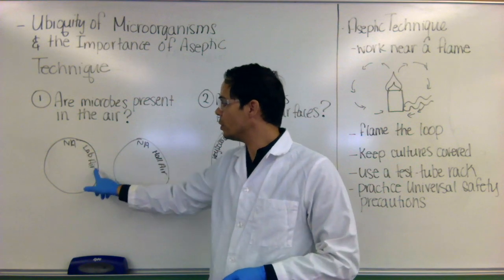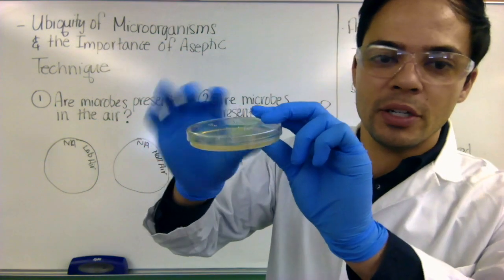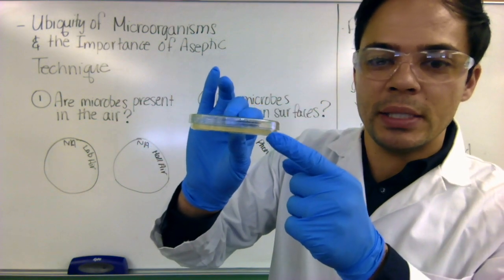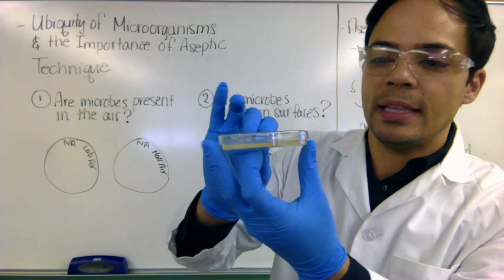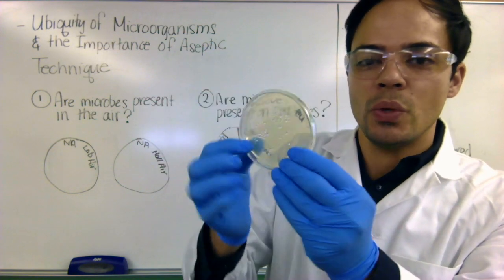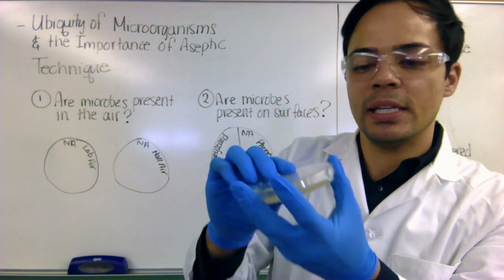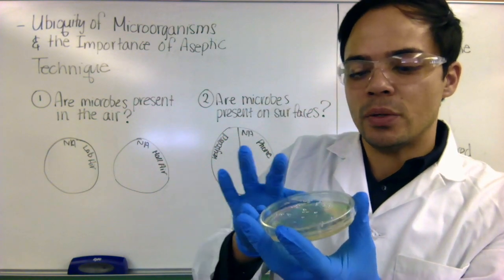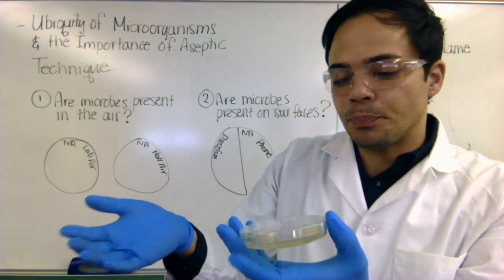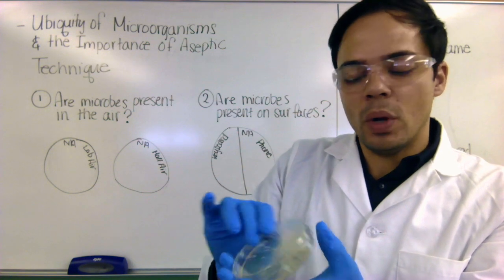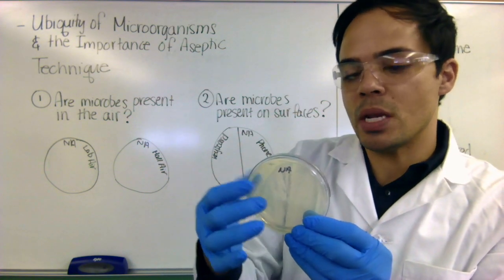Now you always want to label plates on the bottom, on the base. So notice this one has, if I actually look at it sideways, the base is the smaller part, the lid is the larger part, and the lid fits snugly on the base. So you never want to write on the lid and label the lid because lids can come off and there's no media in them. So if it should actually come off accidentally, you won't know what's on your actual medium.